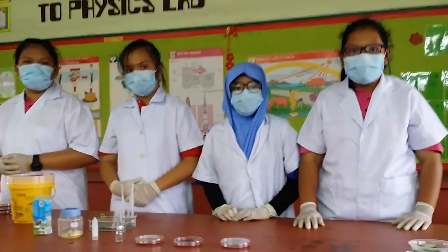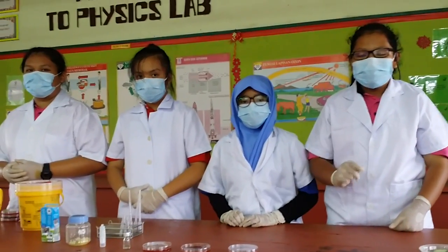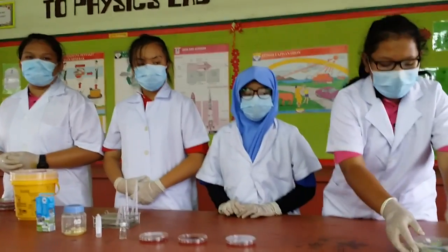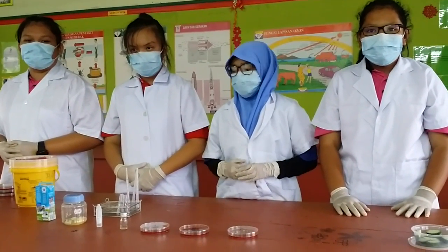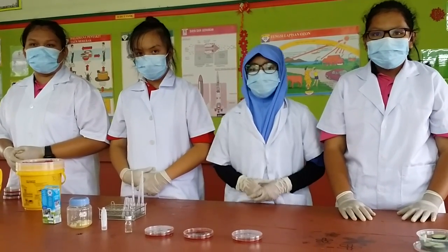Hi, do you like rojak? I bet you like it. But don't you know the ingredients in the rojak may contain the bacteria named E. coli, just like cucumber. Today we are going to share with you about an experiment on how garlic reacts on E. coli bacteria.